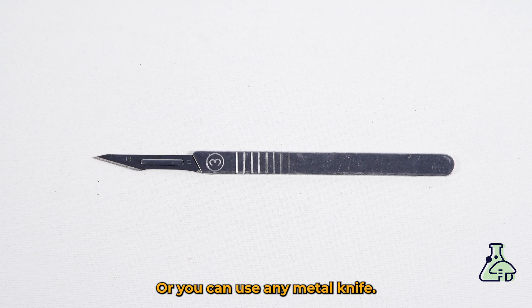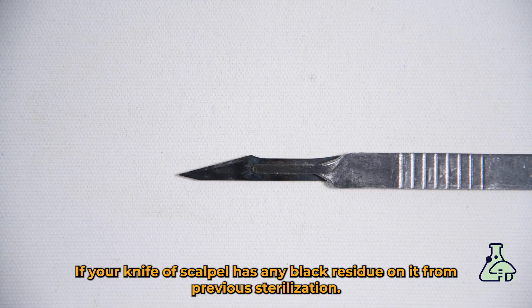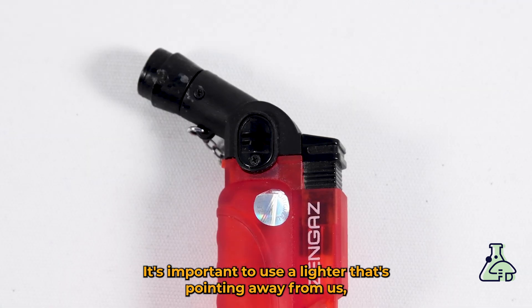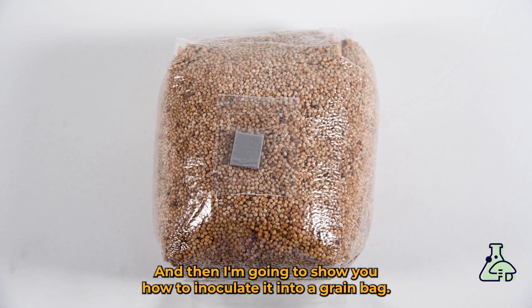In addition, you're going to need a scalpel or any metal knife. Keep in mind you'll still have to flame sterilize it. If your knife or scalpel has any black residue left over from previous sterilizing, don't worry — you won't have any issues as long as you sterilize it properly. You'll also need a lighter. It's important to use a lighter that's pointing away from us because we're using isopropyl alcohol, and a spore print.